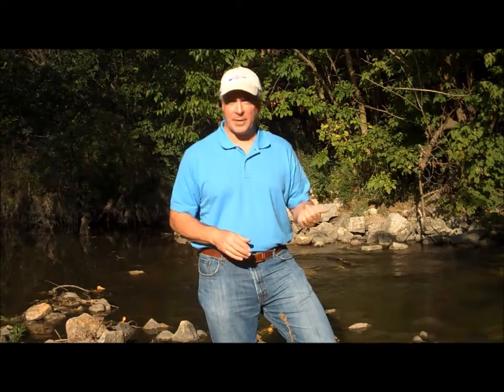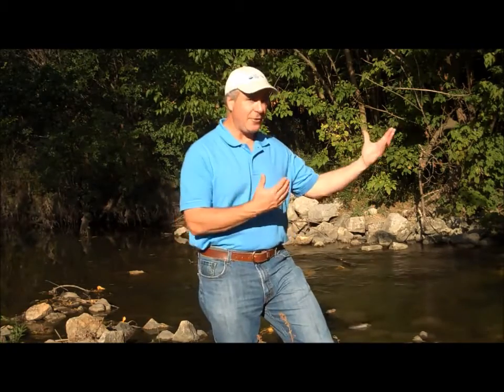So if you dress properly, study these tapes, come out here and do the best possible job you can at collecting real data, we can actually be an asset to our own community in monitoring the water quality of the West Fork of the Chicago River.